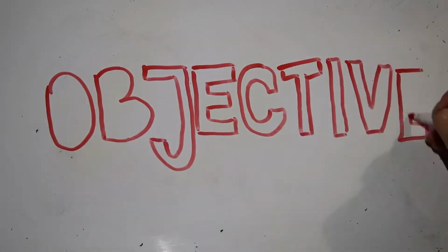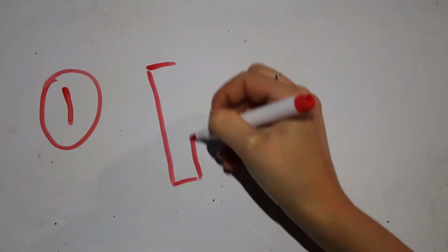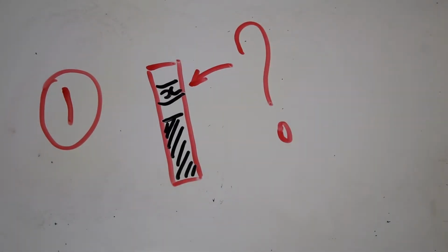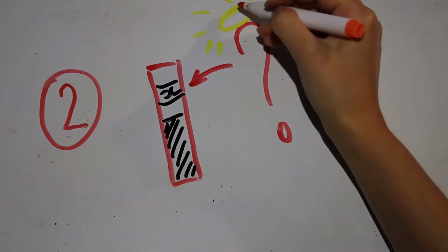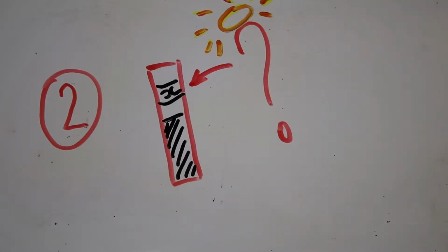For this week's practical, you have two main aims. The first is to find the melting point of an unknown sample through comparing it with the literature melting points in the lab manual. The second aim is to identify the unknown sample. You'll need a sample of both compounds to do this, and a little bit of mixing prowess in order to achieve it. We will then use the purity to determine the name of the compound. The main fact to take away from achieving these two aims is that both were achieved through finding the melting point alone. It just goes to show how useful this value really is.